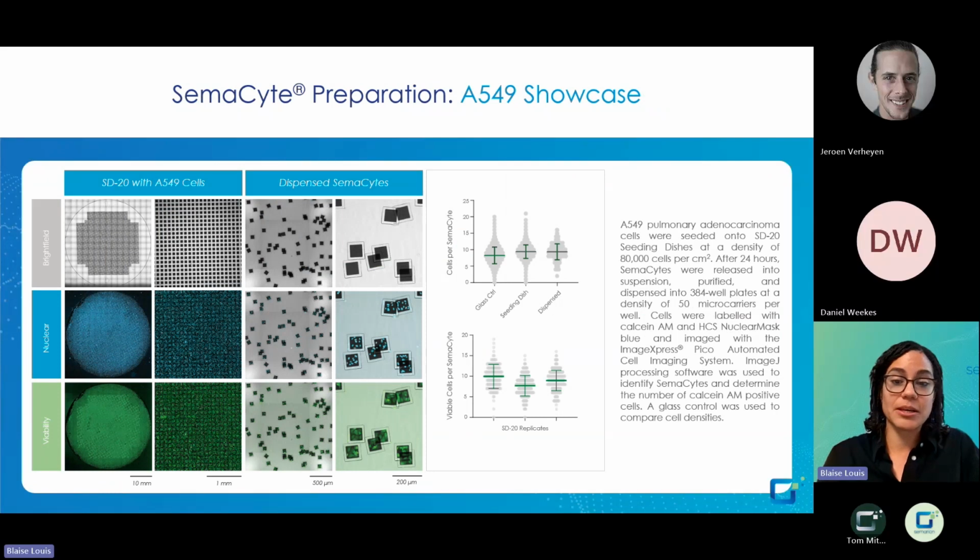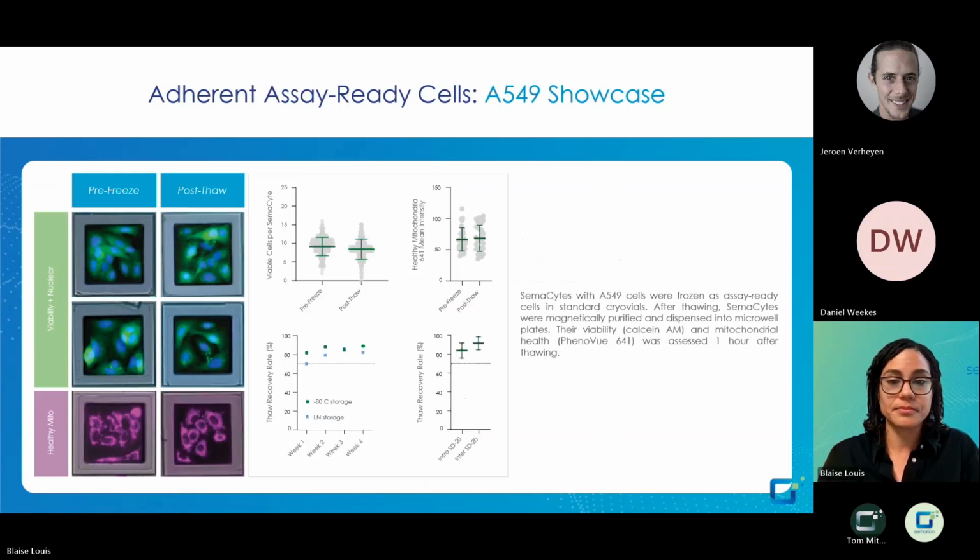Consistent cell numbers per SemaCyte when comparing SemaCytes arrayed in the seeding dish with SemaCytes which have been released in suspension. And we also see comparable numbers of cells across SD20 seeding replicates.